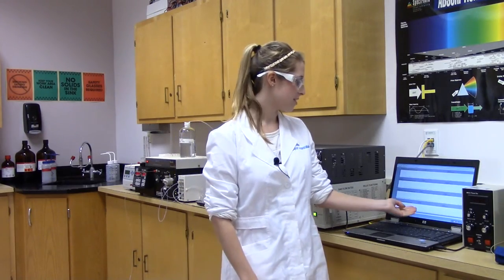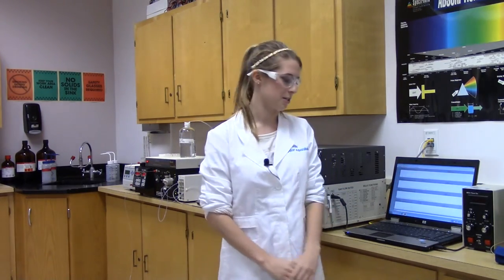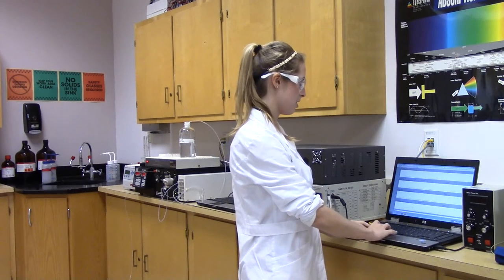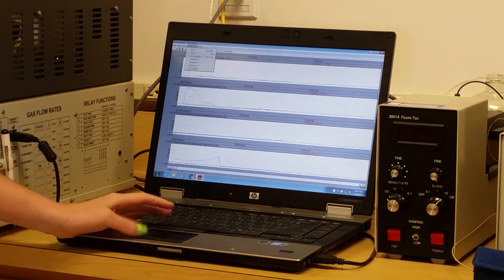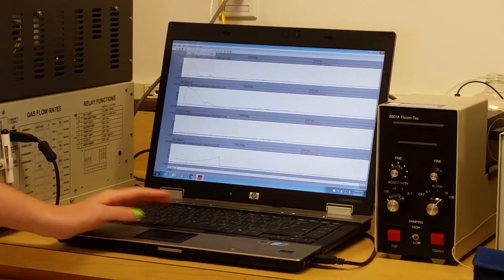When you look at the scans and each one has returned to the baseline, you can stop the instrument. You go to acquisition and stop. The scan is complete.